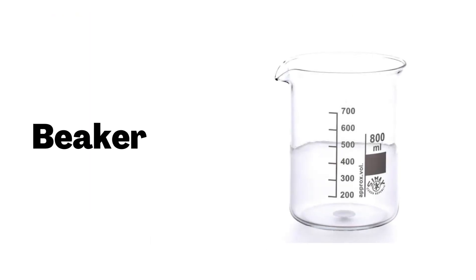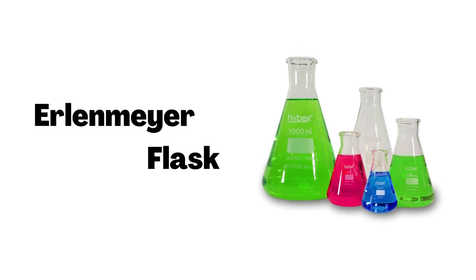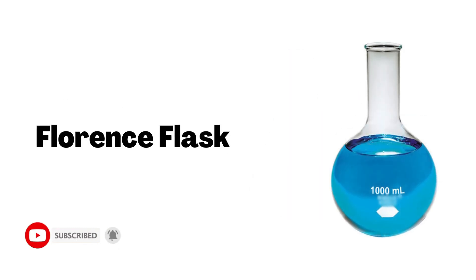Beaker. Erlenmeyer Flask. Florence Flask.